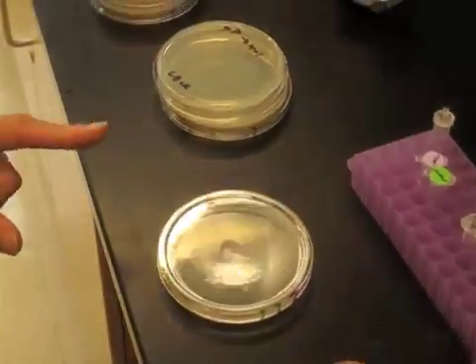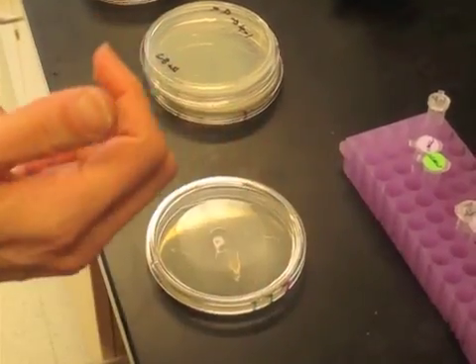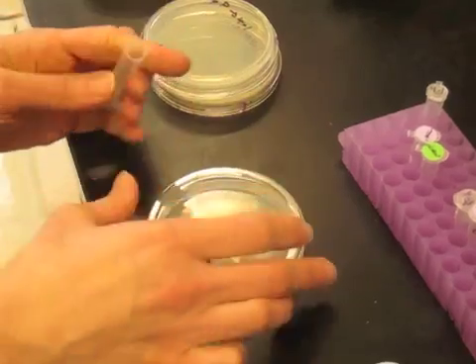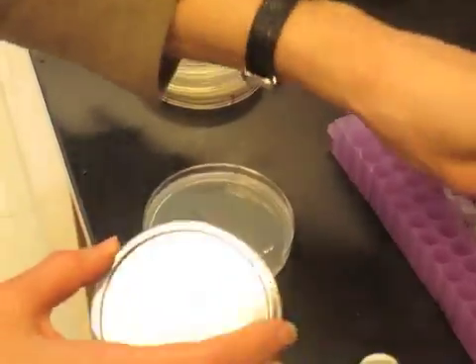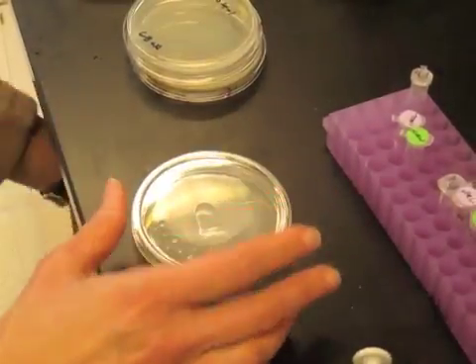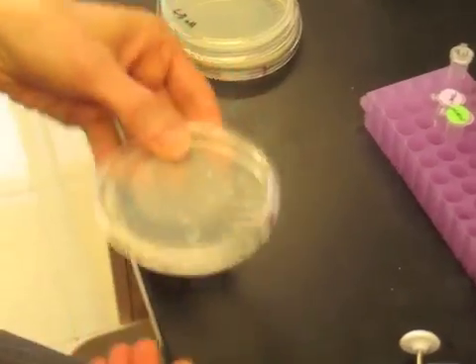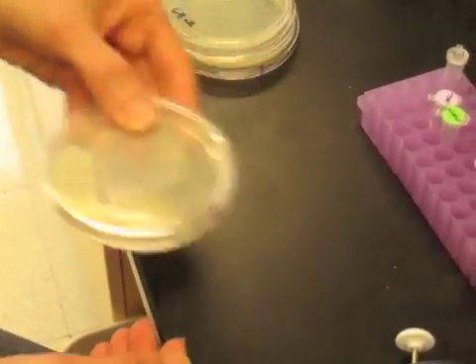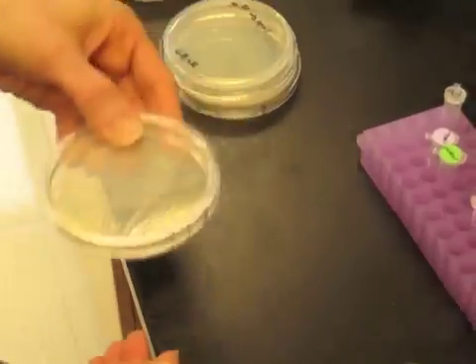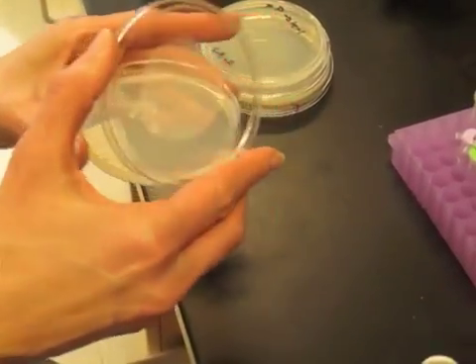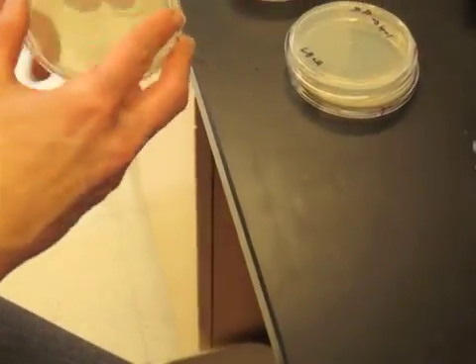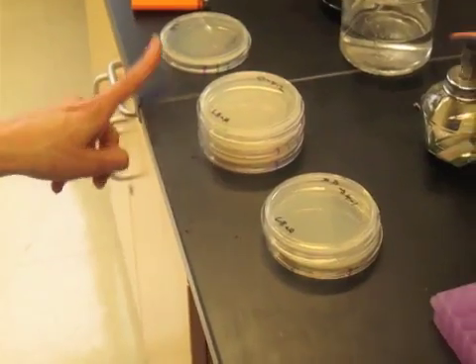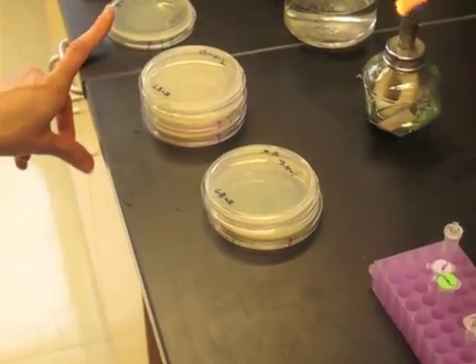One is to take sterile beads like this that you can roll around the surface of the plate like this, and that will spread the liquid over the surface of the plate. And then these can be put into hazardous waste or into a bleach solution to be re-autoclaved or sterilized again.